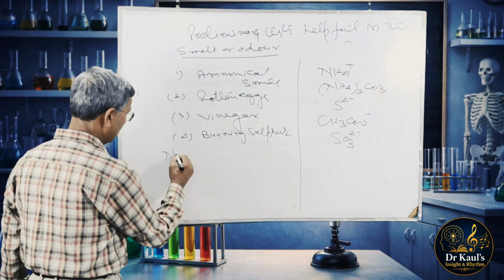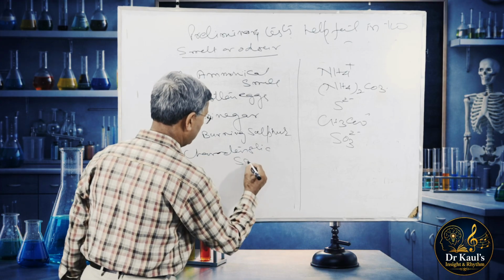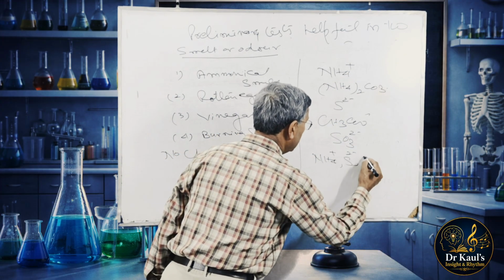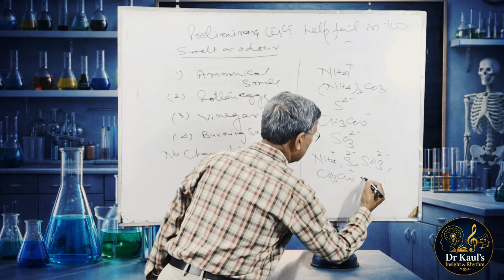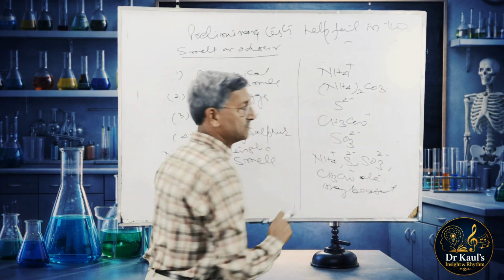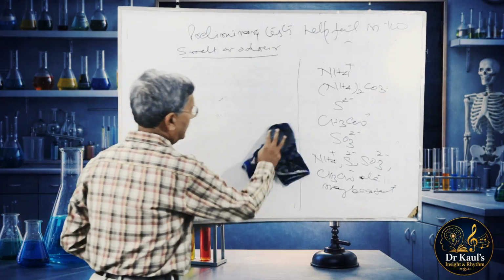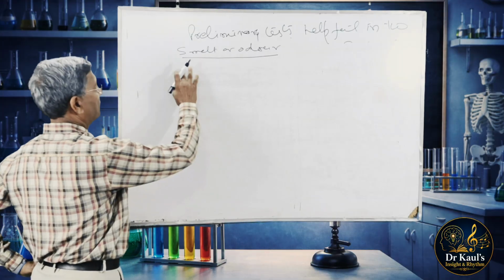And if there is no characteristic smell, it could be the absence of ammonium ion, sulfide, and acetate, etc. So this was the second part. And the third part is density and physical state.